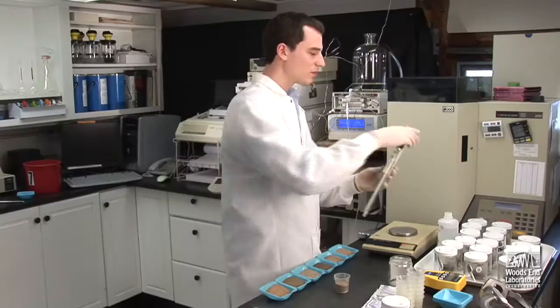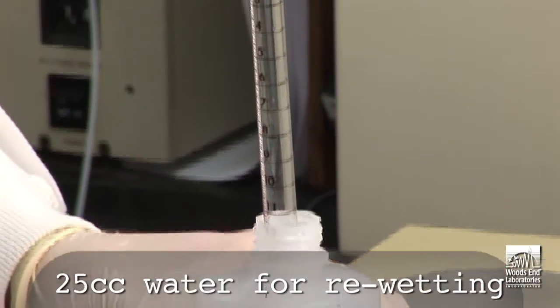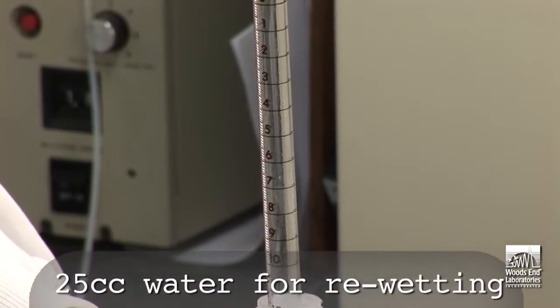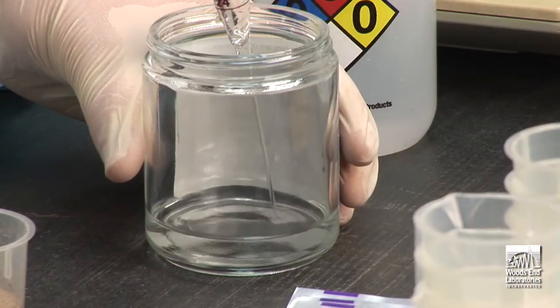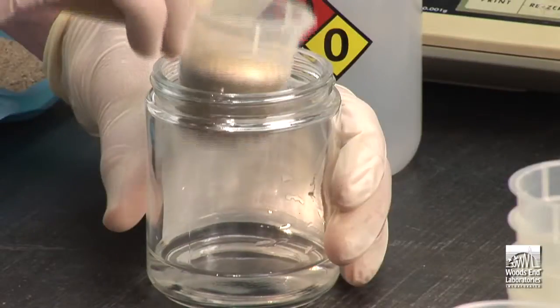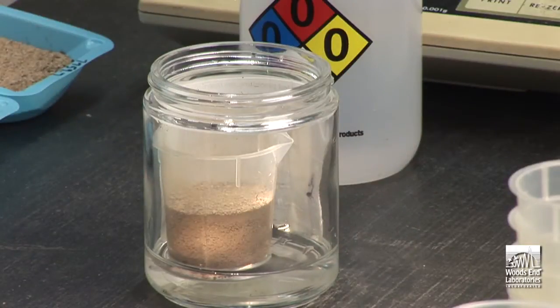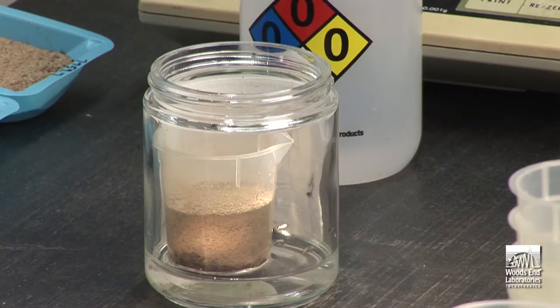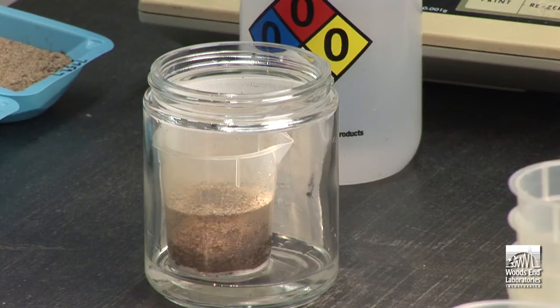Now add 25 cc of deionized water to the bottom of the glass jar provided with the test. You can choose how you best measure and inject the water. Insert the beaker containing the soil into the jar and you will notice the water begins to wick up from below, which will slowly bring the sample to field capacity. This protocol has been shown to both simplify and speed up lab preparation and to standardize water additions.